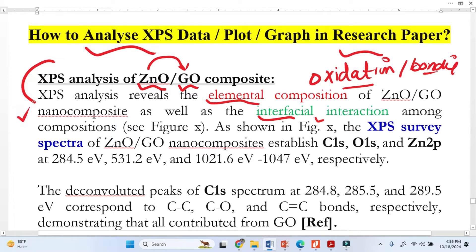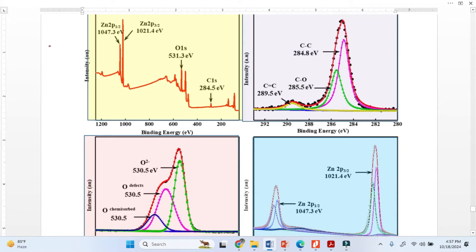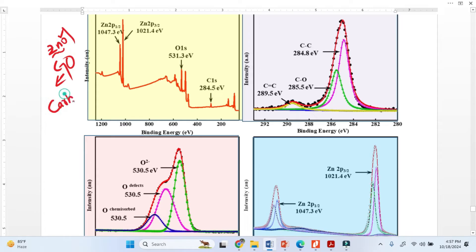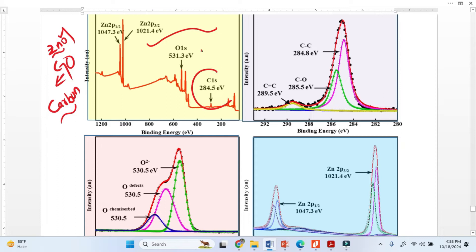Our material is zinc oxide and graphene oxide composite. So in the XPS spectra there must be zinc, there must be oxygen, and there must be carbon — because graphene is made from carbon. We will find these three elements. This first spectrum is the survey spectra, and we can clearly see carbon, oxygen, and zinc — identifying what elements exist here.